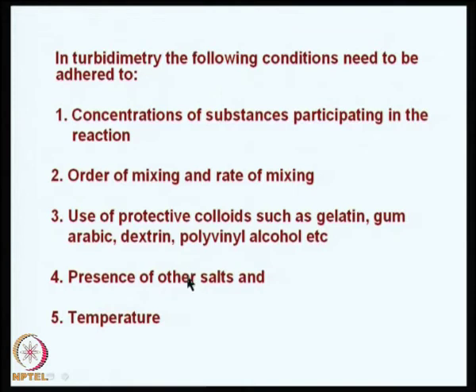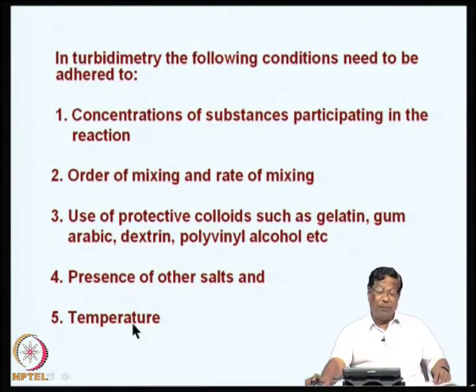If you want to determine some substances in urine, for example, again the concentration of other salts assumes very high importance as far as reproducibility in turbidimetry and nephelometry are concerned. And that is why it is important to know the presence of other salts in the sample you want to analyze. And finally, the temperature.